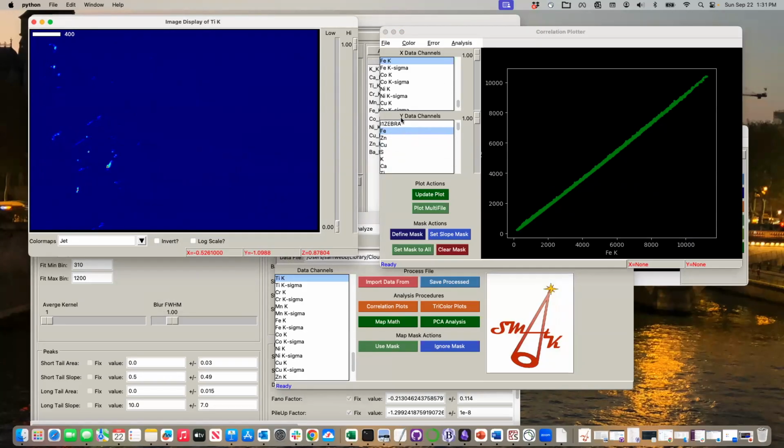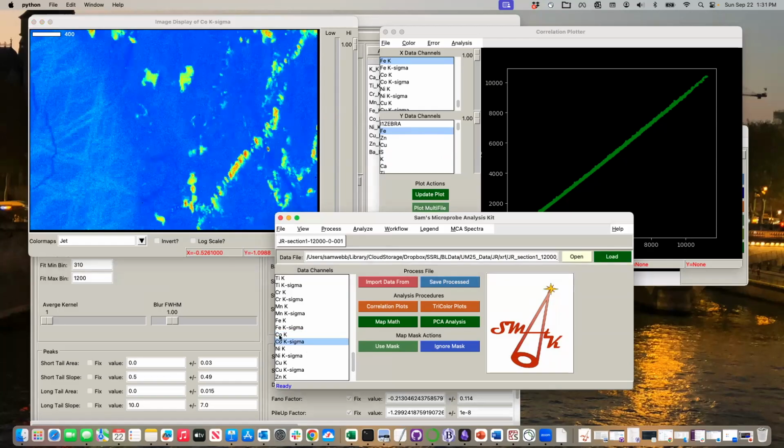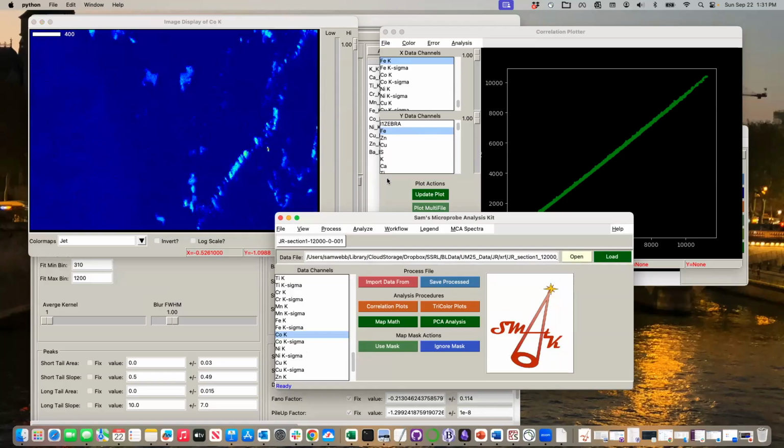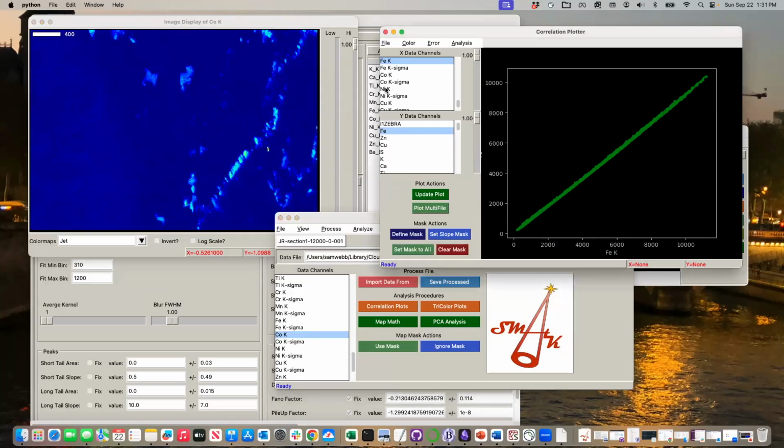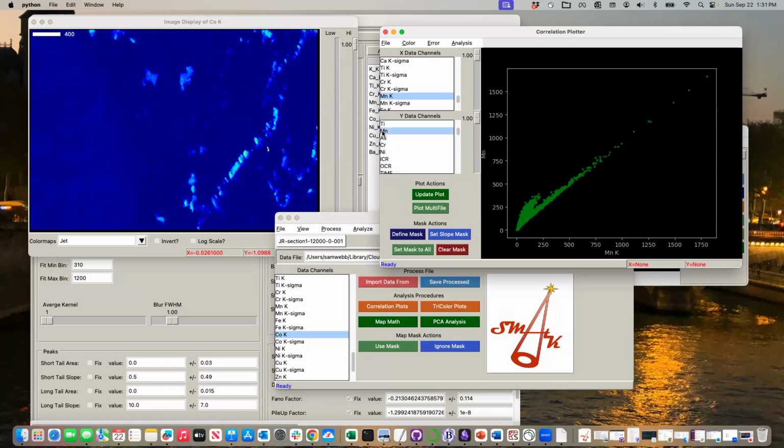What else do we have? You could try to see, did we have any cobalt that came out in our maps? Maybe some real cobalt was here. Big error bar on the cobalt too, but we'll take a look at that in a minute. Our question came down to manganese, of course, though. So here's our manganese, and here's our manganese.